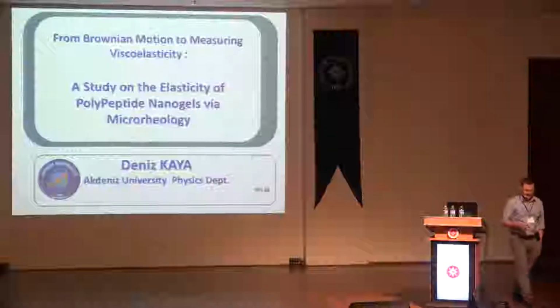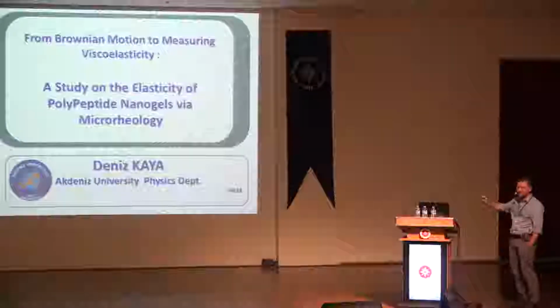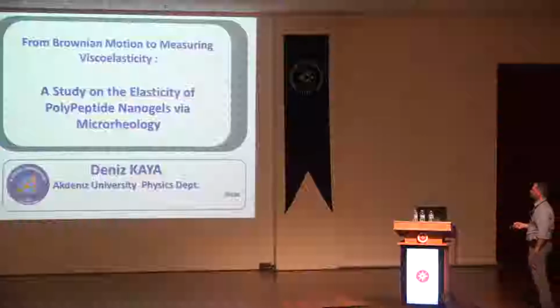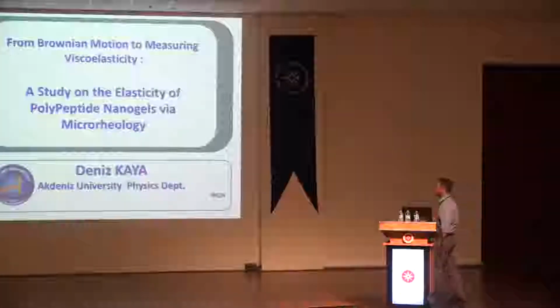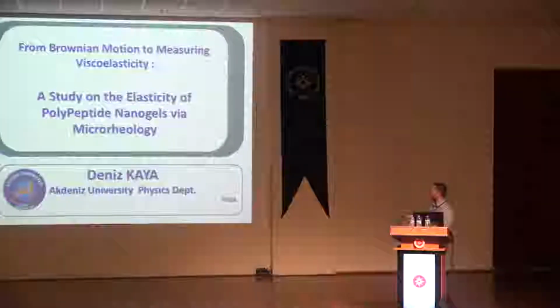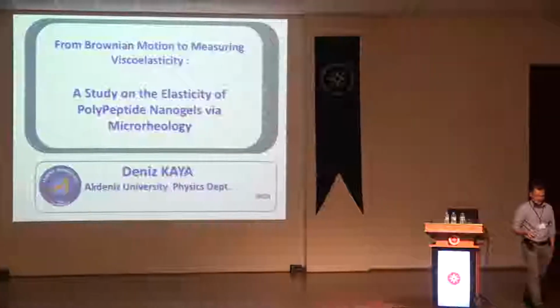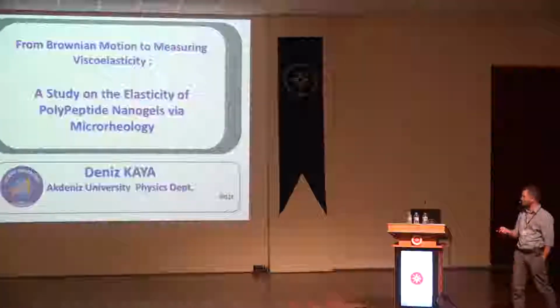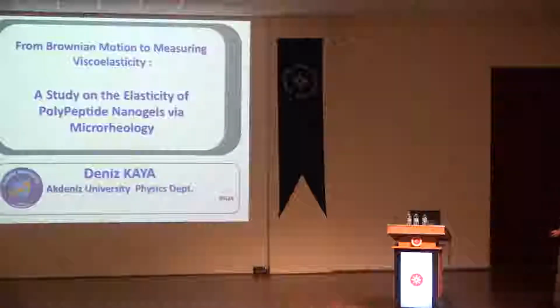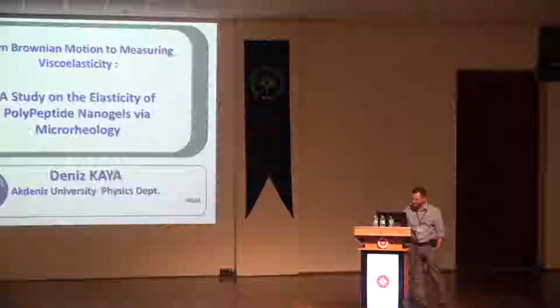Well, my name is Deniz Kaya from Akdeniz University. First, I want to apologize for a very long title. Today, I'm going to talk about the study of the elasticity of the polypeptide nanogels. But the main idea of this talk, or the purpose of the talk, is a promotion for this technique, which we call microrheology.